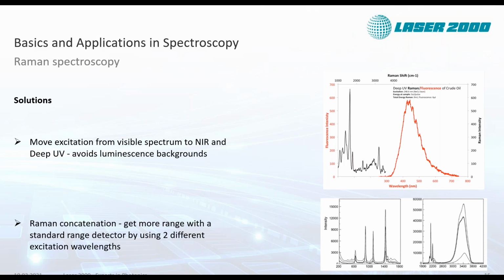This contains a lot of structural information on the atomic or molecular structure. But sometimes it's necessary to do more proper quantification or identification via the stretch region, especially for polymers, where you can distinguish them.